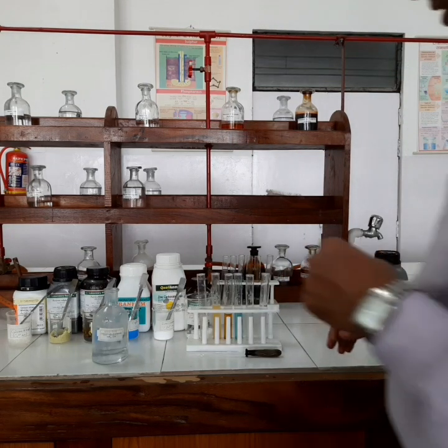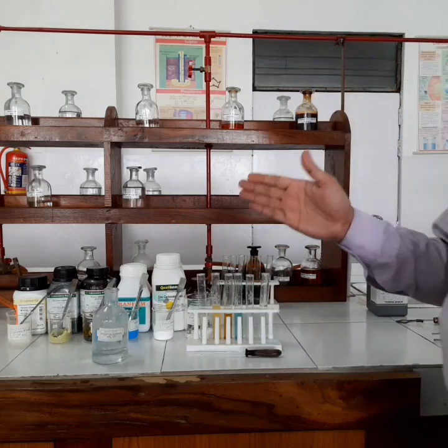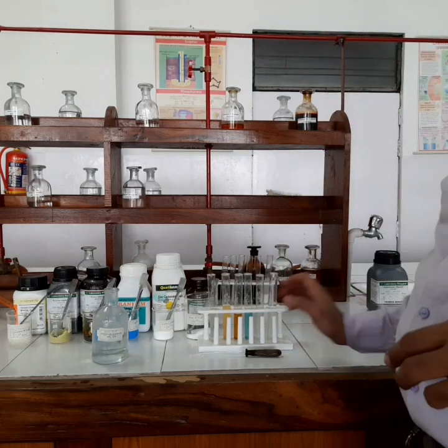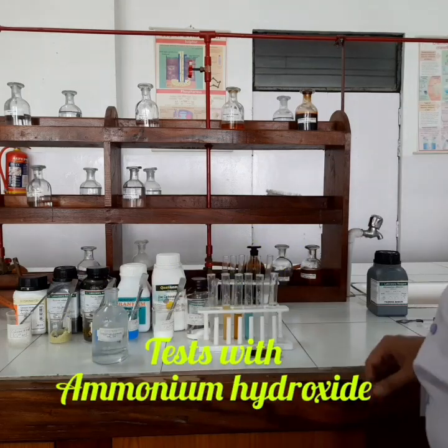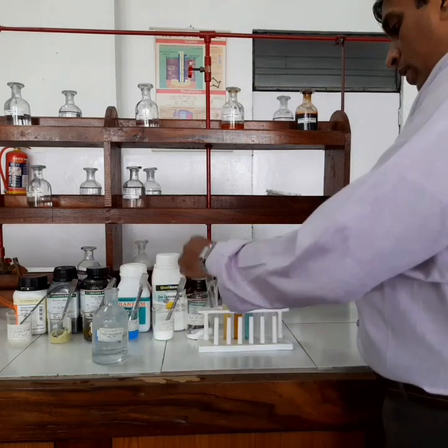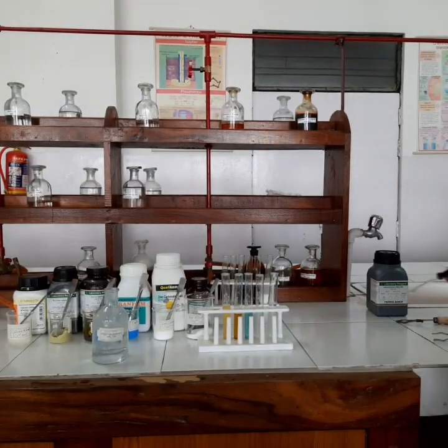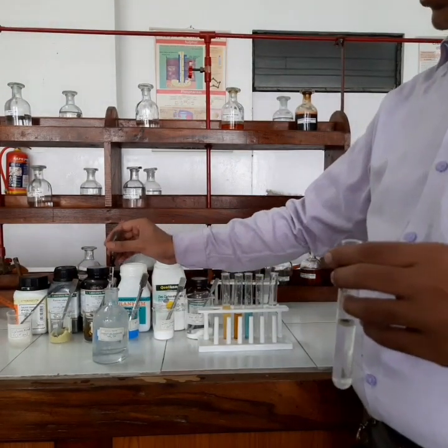Now I am going to perform the same test for the same ions, calcium, ferrous, ferric, copper, zinc and lead, with the help of ammonium hydroxide. Now ammonium hydroxide is a weak base, as I have told you. So on adding ammonium hydroxide to calcium salt, you are not going to get any precipitate.